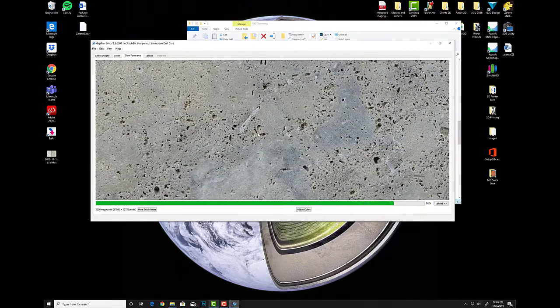But here you go. So this image is 90% complete. It looks like it's going to take about 15 minutes. We should be almost at the end, and then once this is finished, what we'll do is we'll just upload it to the Gigapan server, which is where we have the other 2 final core images stored, and then you can do a side-by-side comparison of all 3 using this tutorial page just to see and evaluate the change in quality for yourself. So that really is the end of the XYZ scanning tutorial video.